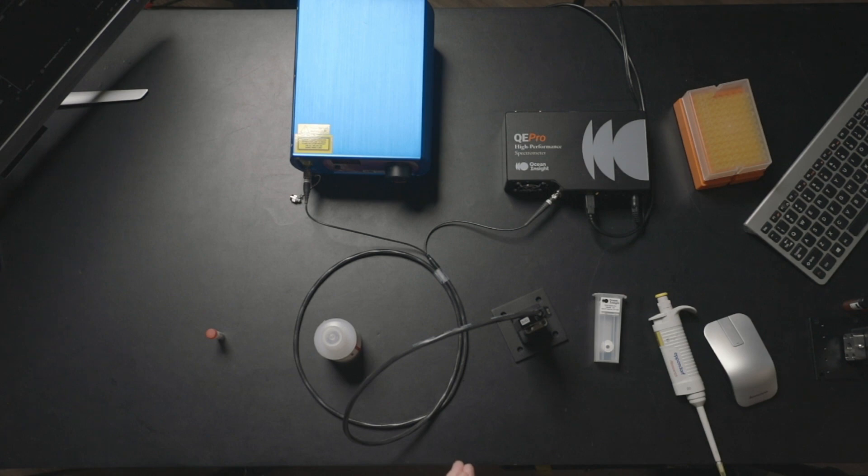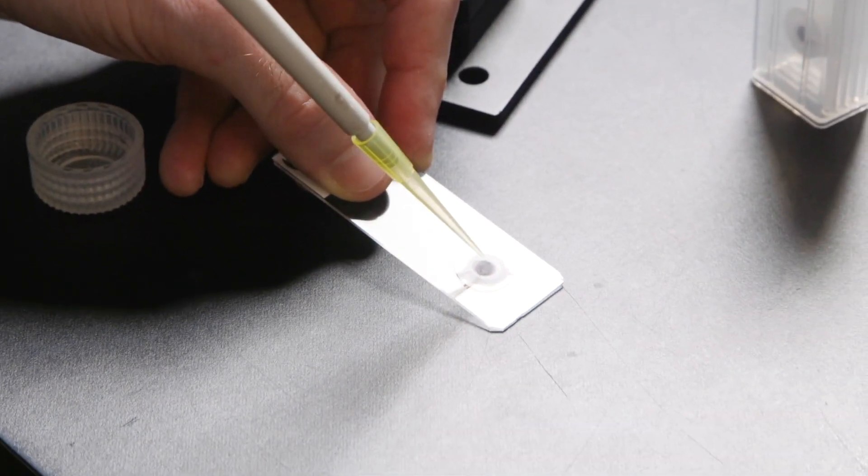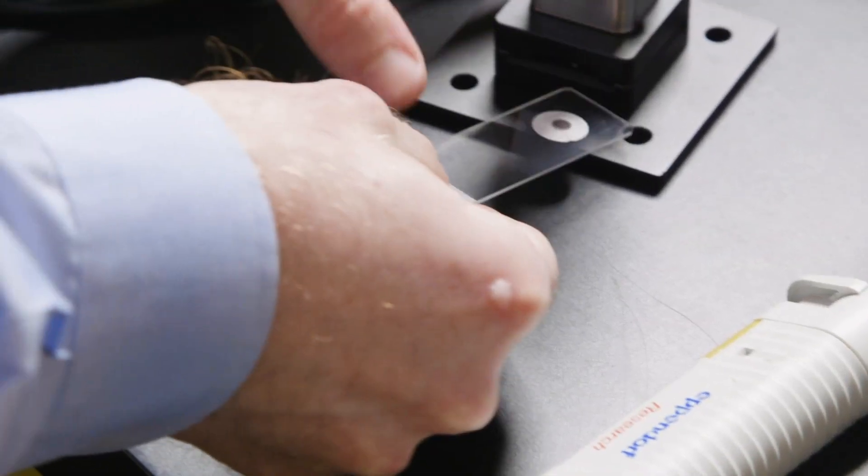All we're going to do is show you how easy it is to take a sample background scan of our SERS substrate, then apply the analyte and get a meaningful reading. So this is ultra pure water — we're taking about five microliters of this and placing it onto our SERS substrate.